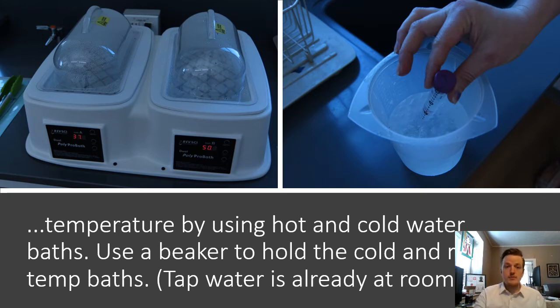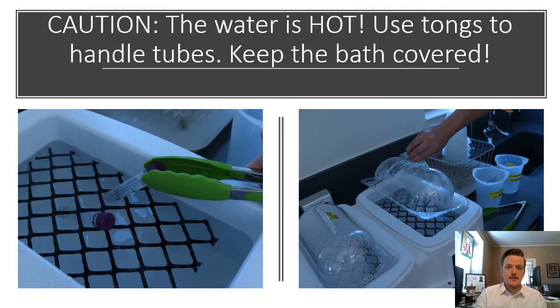As always, you need to be cautious when using these. The water is hot. It's a hot water bath, so you need to keep it covered. With these things, I can tell you from experience, the steam condenses on the top, and then when you go to pull it off, all the hot water tries to run down on your arm, and you don't want that. So when you're using these things in the future, be very careful when you are taking the covers off.